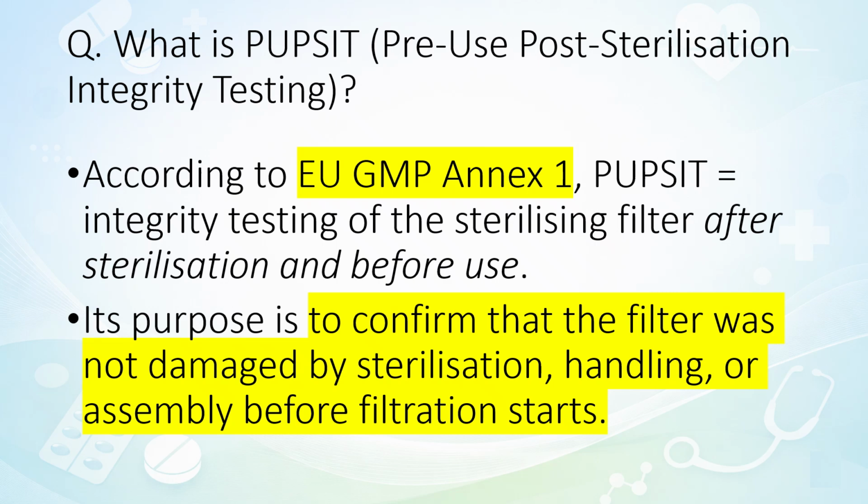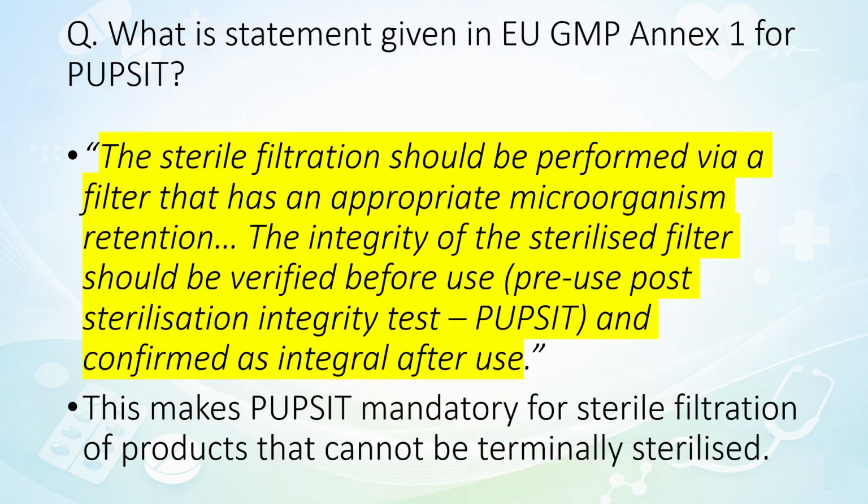Welcome. What is PUPSIT, or pre-use post-sterilization integrity testing? According to EU GMP Annex I, PUPSIT is integrity testing of the sterilizing filter after sterilization and before use. Its purpose is to confirm that the filter was not damaged by sterilization, handling, or assembly before filtration starts.